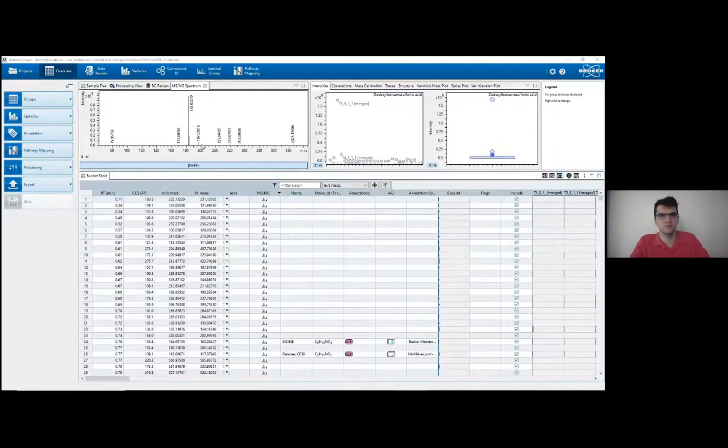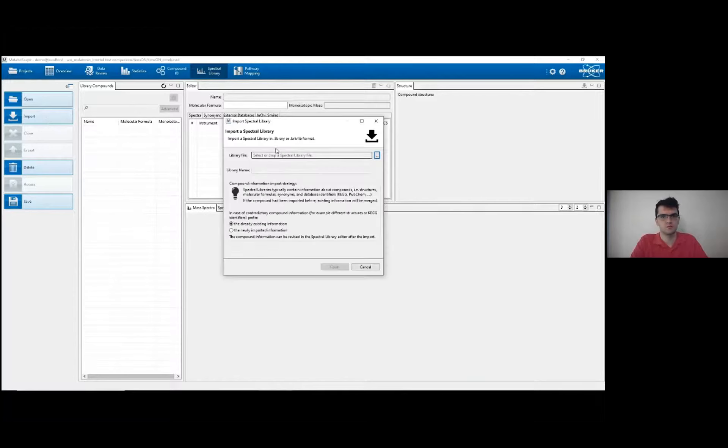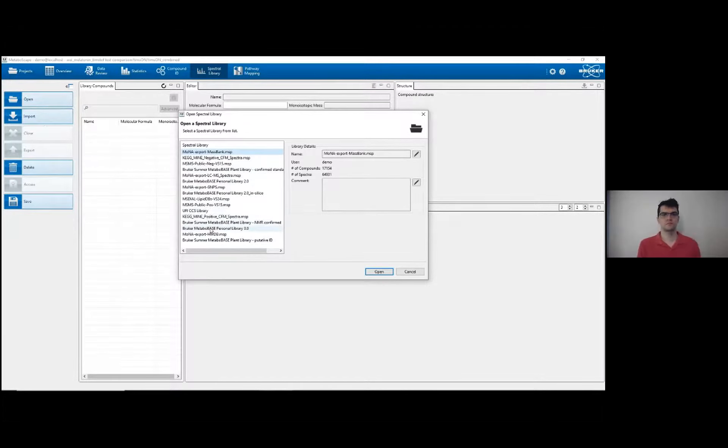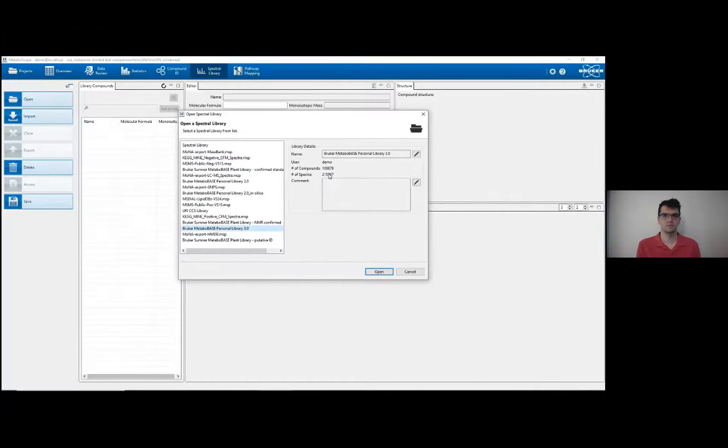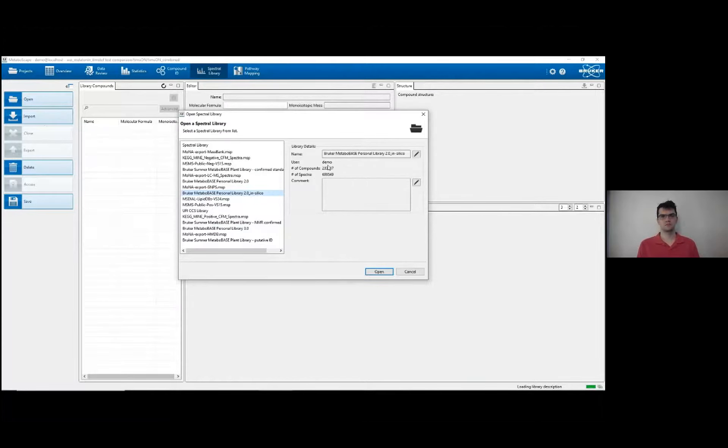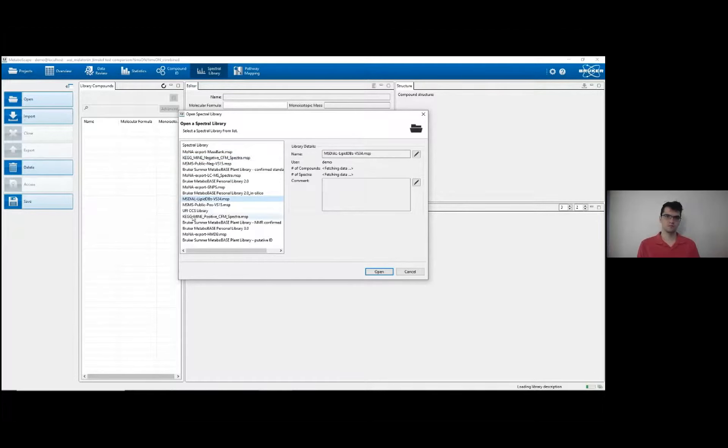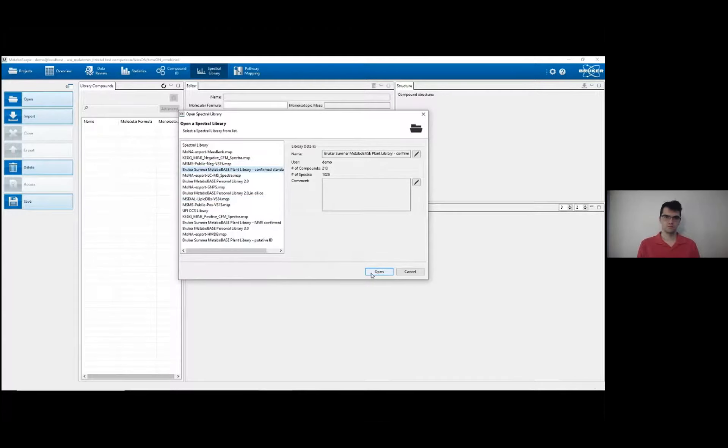Importing a spectral library in MetaboScape is fairly simple. By selecting this tab and hitting import, and picking the right file can be done in one step. I've already done that for a whole variety of spectral libraries here, so I can show you what they look like inside. For example, here we have Bruker's MetaboBase Personal Library 3. This has 100,000 compounds and over 200,000 spectra, so it's very large. We also have this in silico library from Bruker, which has well over 200,000 compounds. You can see it takes a long time to load since there's so many. There are smaller ones here, for example from MONA, KEGG, MassBank, as well as even smaller ones, such as from Lloyd Sumner's lab, who did a lot of different plant compounds. I will open that one since it's small and easy to look through.